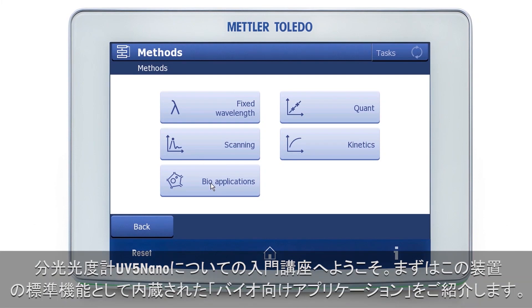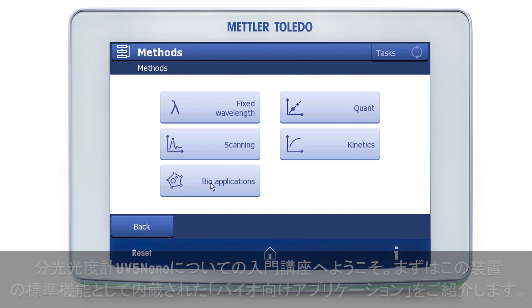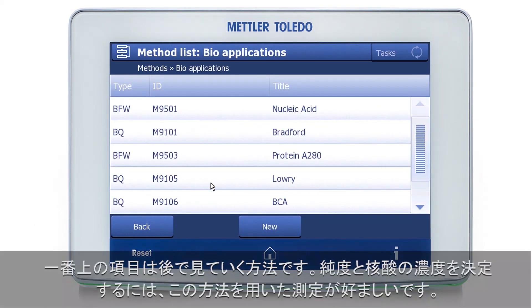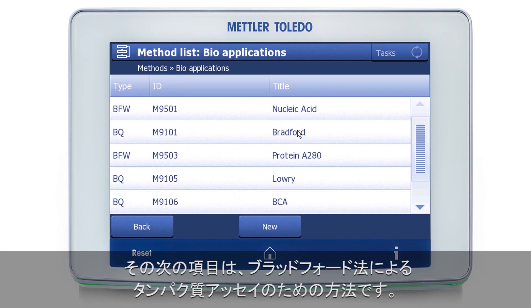You see here the BIO applications which are built in as a standard instrument. All these applications can of course be modified and adapted to suit your needs. Here is for example the first one, a method which we will see later on. I will perform measurements using this method to determine the purity and the concentration of nucleic acids, followed by a method for protein assays according to the Bradford method.